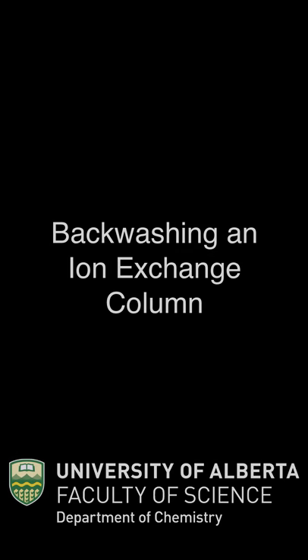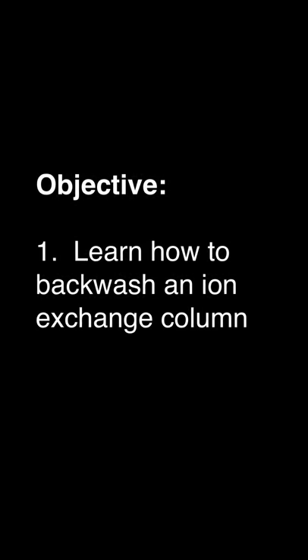Backwashing a Column. The objective of this video is to learn how to backwash an ion exchange column.